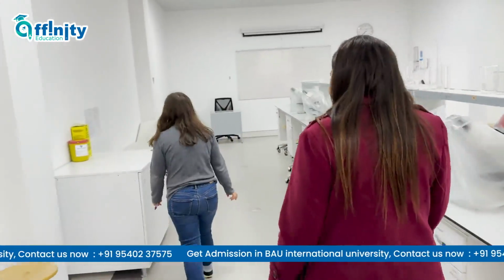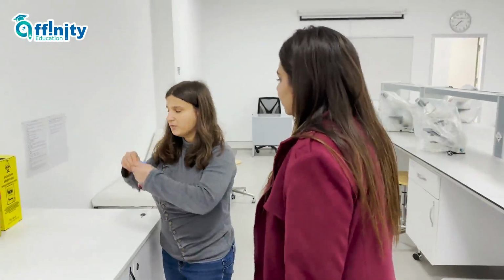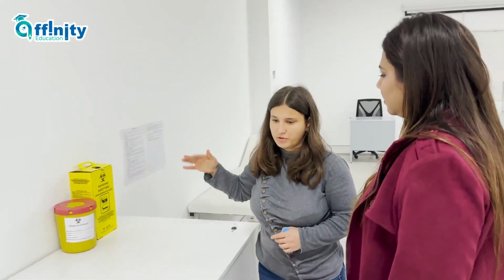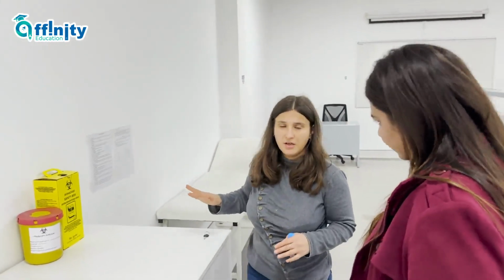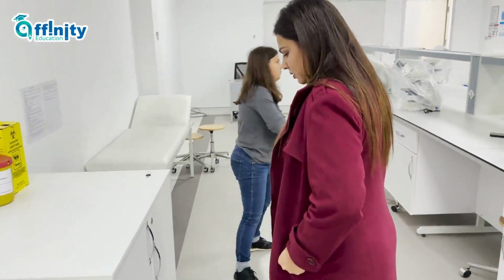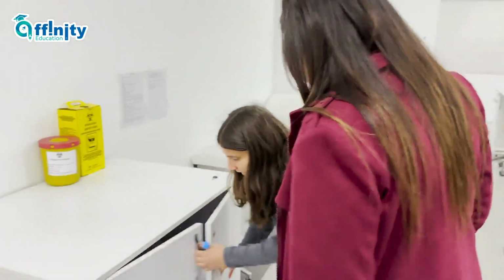This is for waste. As I said, you can use microbes and everything. You should put everything here. This is not going to a random trash. This is going to special trash, which then neutralizes these microbes and everything. If you work with blood and everything, you should put everything here. And what is inside? Inside there now, nothing.